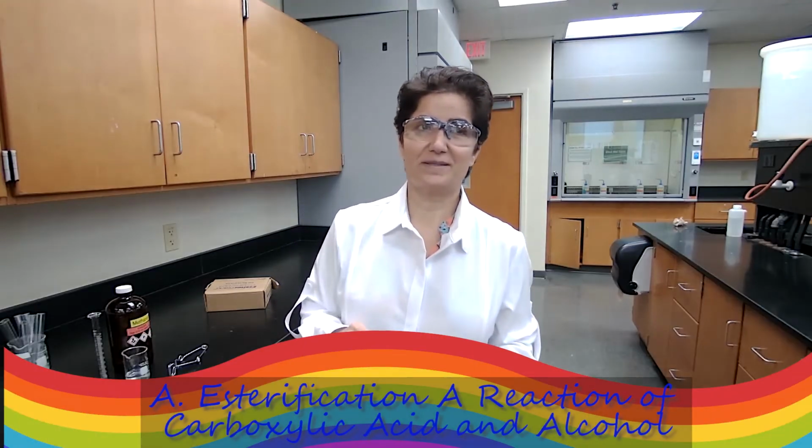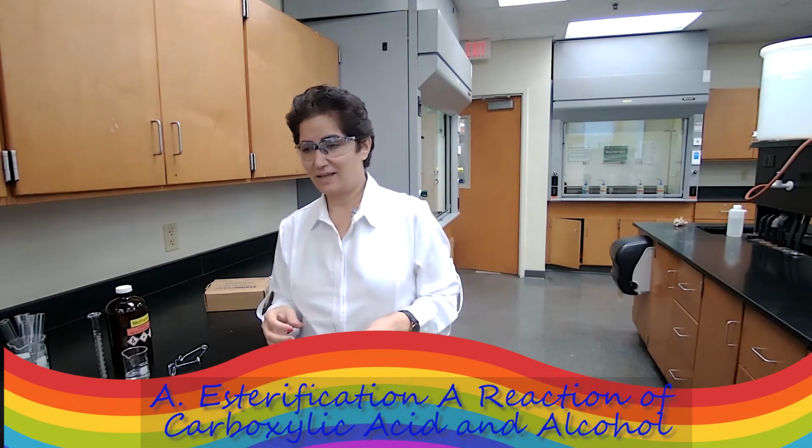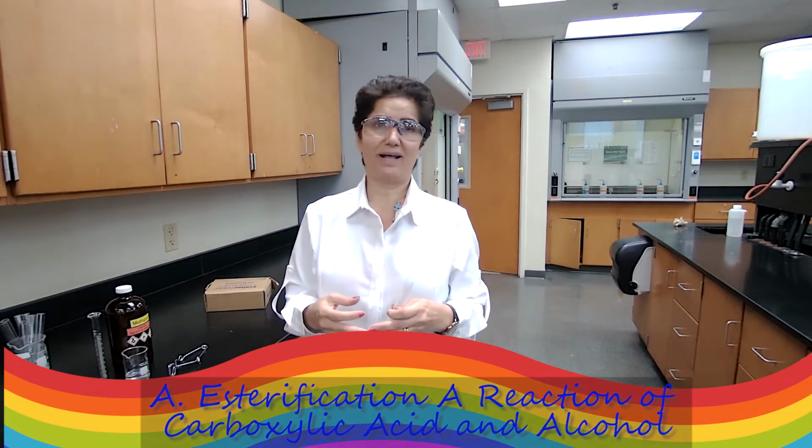The last part of the experiment is esterification, which is the reaction between a carboxylic acid and an alcohol that generates an ester. We do need a catalyst of sulfuric acid. That's what we are using as a catalyst today.